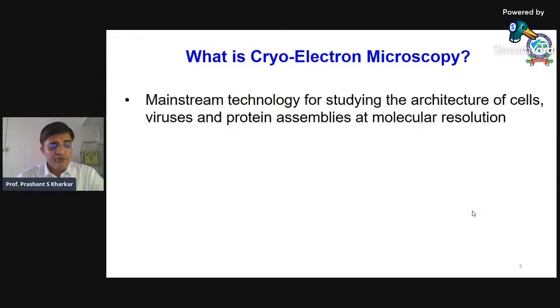Meaning, if you know about the Human Genome Project, and the kind of structural information, or rather the targets which can be exploited for drug discovery, that's humongous. But for many of these targets, we do not have any information on the structural aspects, meaning we don't know how their three-dimensional structures look like. We know their cellular localization, but we probably don't know their three-dimensional aspects. So when it comes to structure function analysis, there are a lot of gray areas, because of which utilizing these targets fully for therapeutic exploitation becomes a real problem.